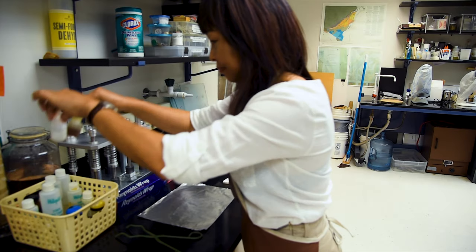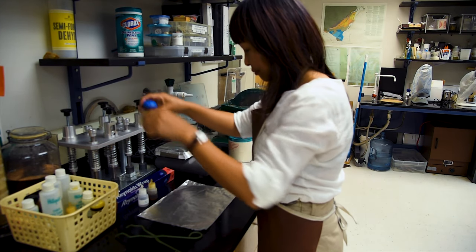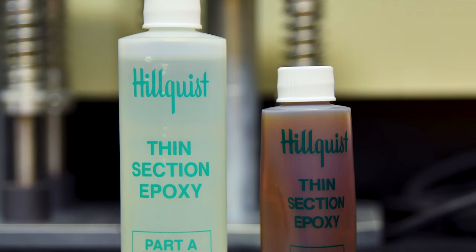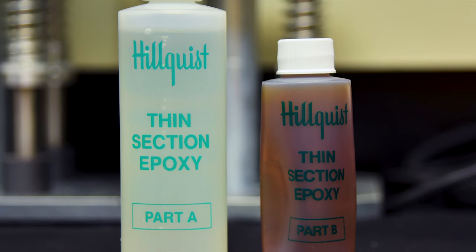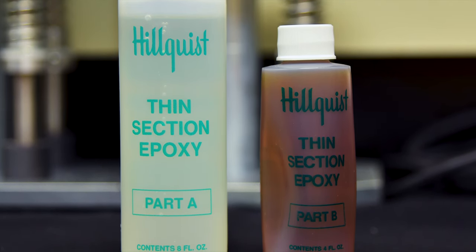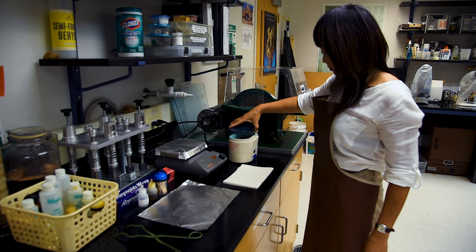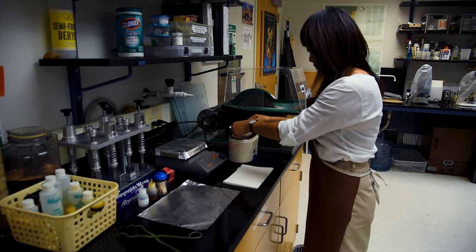There are a variety of different thin section epoxies that may be used, so you will need to familiarize yourself with the proper use of the epoxy that you have. Here at Nova, we are using a common thin section epoxy from Hillquist which comes in two parts, part A and part B, that must be mixed together before being applied to a sample chip and cemented to a glass slide. Mixing them together in the proper proportion results in a chemical reaction that hardens or cures the epoxy.